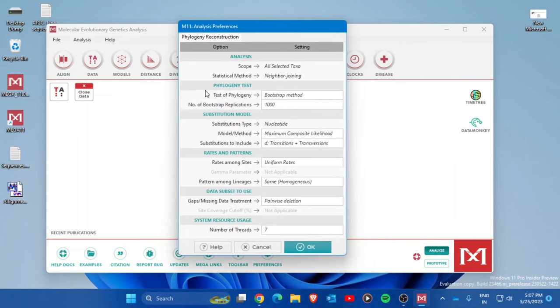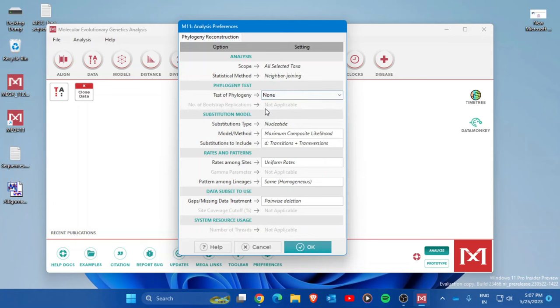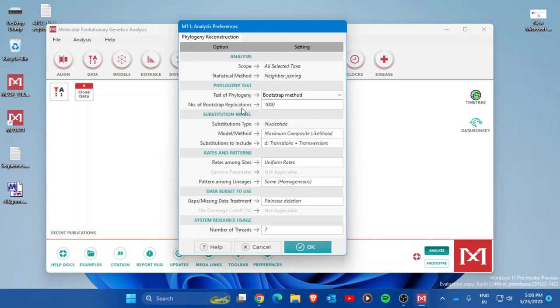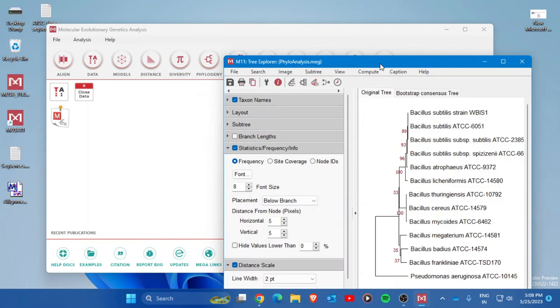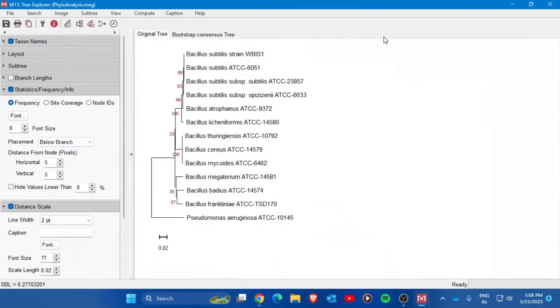A new window will open. If it's your first time using the software, the default setting in the Test of Phylogeny will be None. You need to change this to 'Bootstrap Method' and set the number of bootstrap replications to 1000. Once these two changes are made, press OK. The software will process the data and the phylogenetic tree will appear.